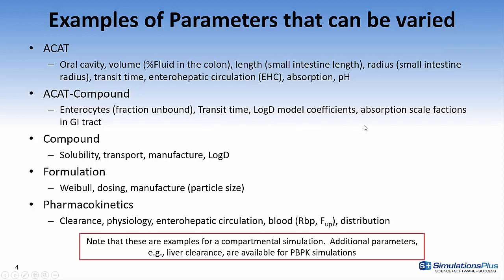absorption scale factors in the GI tract, then compound-specific properties such as solubility, transport, manufacture, log D.